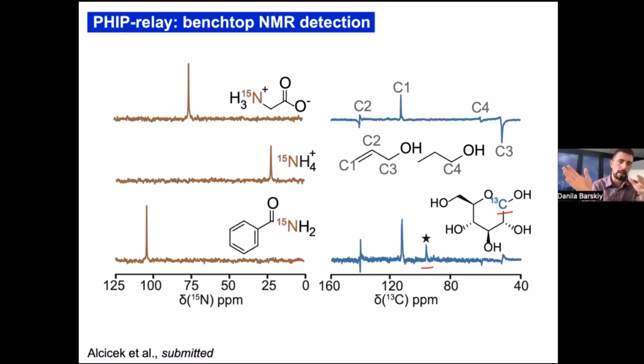can lead to effects which will affect, for example, your pulse sequence. If you want to do pulse sequences at high field and you want to be very specific with some selective pulses, for example, it becomes challenging for very simple practical reasons to work at high field.